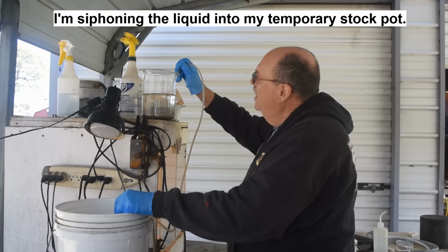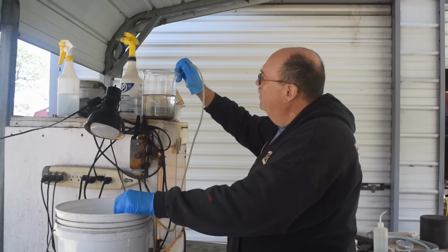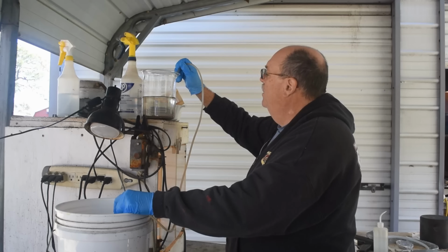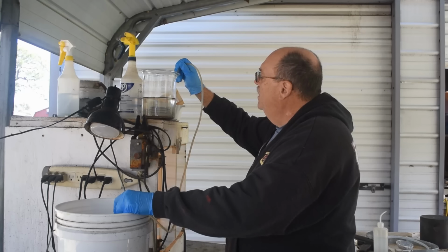Normally, I would transfer this stuff to a smaller beaker, because there's not that much gold in here, and it's a really big beaker. But there's a lot of fine gold stuck to the sides of the beaker. So I'm hoping that if I leave it in this beaker and give it some boils, all that fine gold will wash down and join its buddies on the bottom. So I think I will try that. I think we'll just try boiling it in this big beaker, at least initially. If it all agglomerates together, maybe I'll transfer it over to a smaller beaker then for further cleaning.